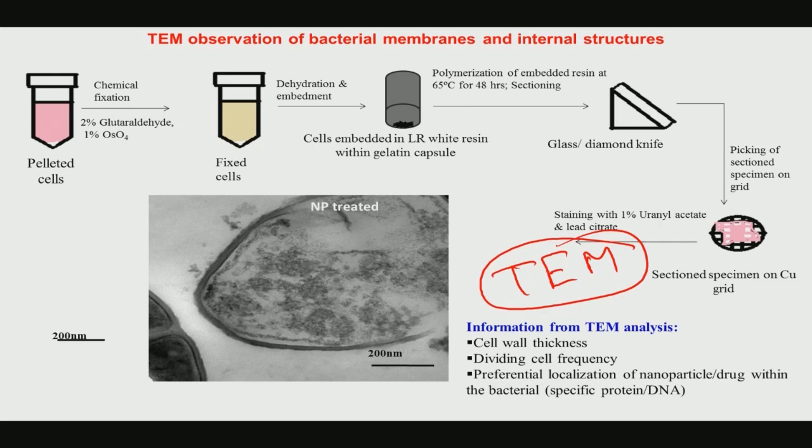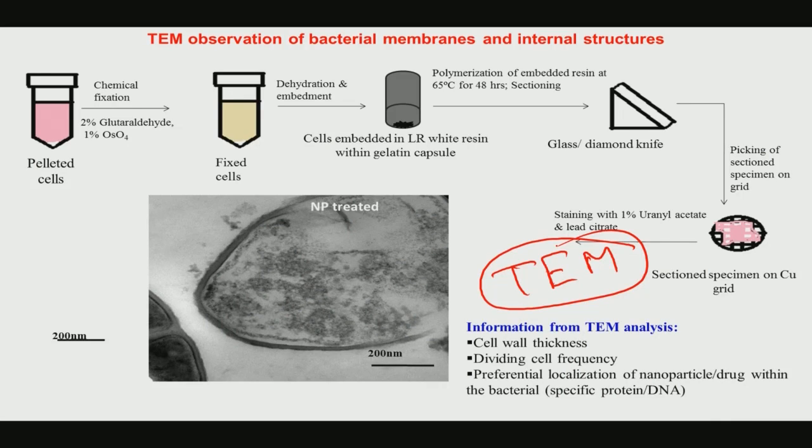So, there is a technique called ultramicrotome. With this ultramicrotome, you can essentially make very thin sections. What you do is, you first grow the cells in a certain growth medium, and then you allow the bacteria to grow. One of the techniques in TEM sample preparation that one has to be careful about with biological samples is to use osmium tetroxide, OsO4, or glutaraldehyde.